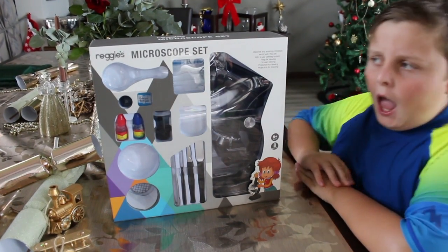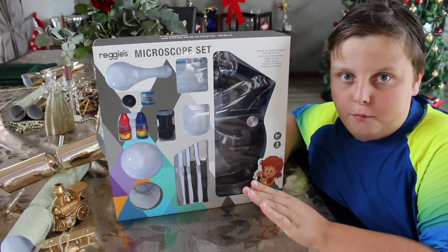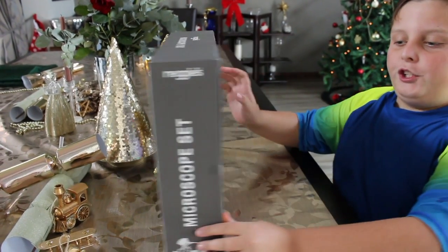Hi, Tristan Tube here, and today I'm bringing you the microscope set from my Christmas toy haul. So let's take a look at what you get.